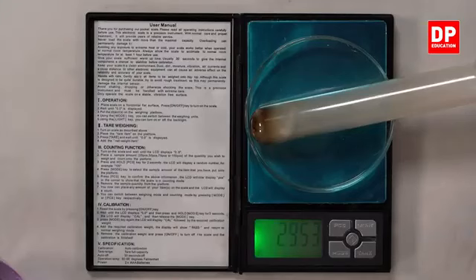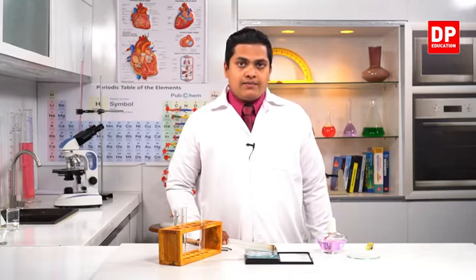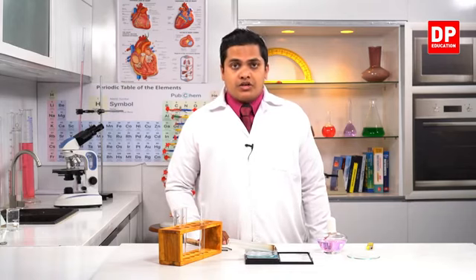So in the earlier case, my dear children, you could observe 29.62 was the answer. But after the chemical reaction, I can get a clear observation. It's been reduced to 29.53. Means that some amount of mass has been reduced during this chemical reaction or chemical change.